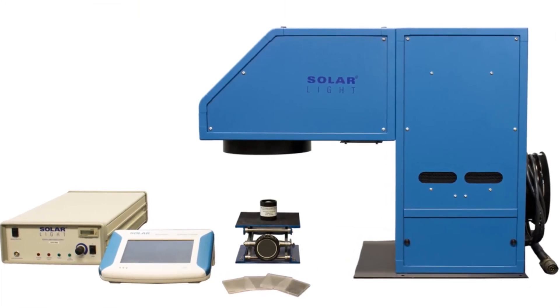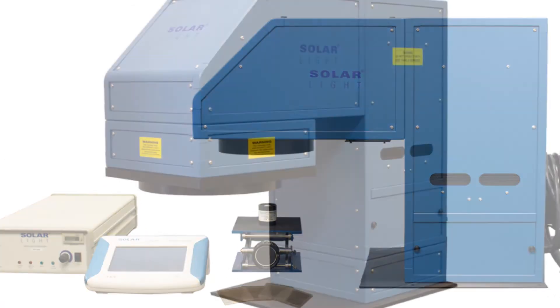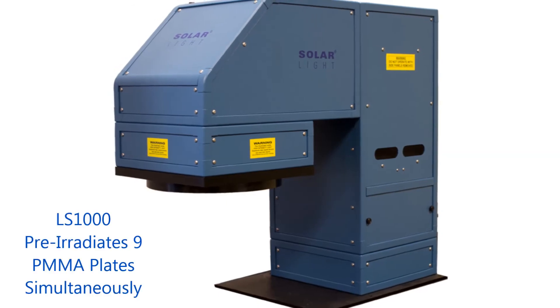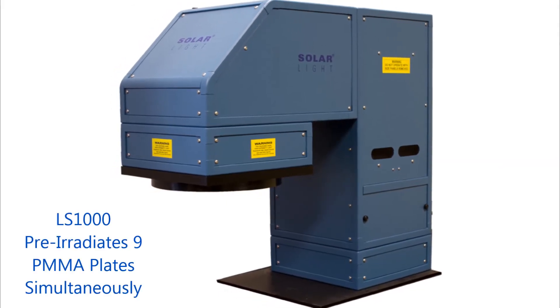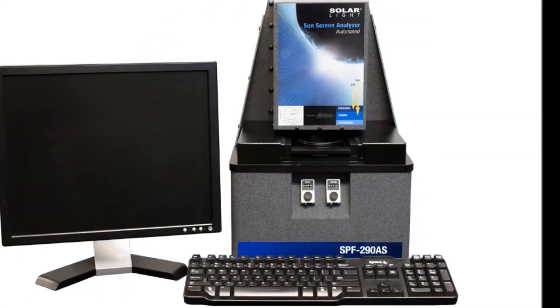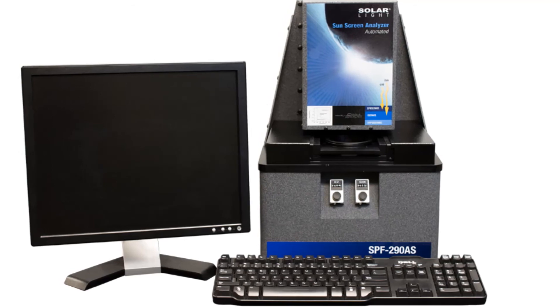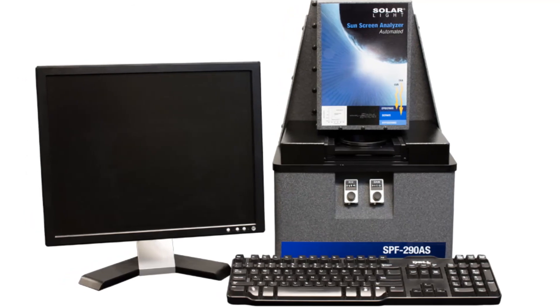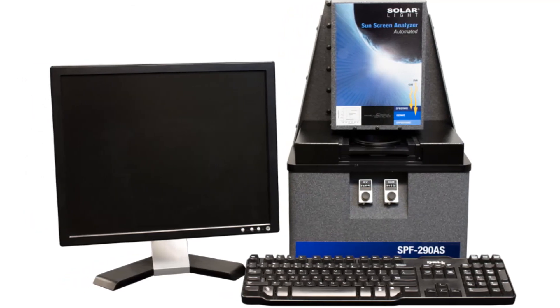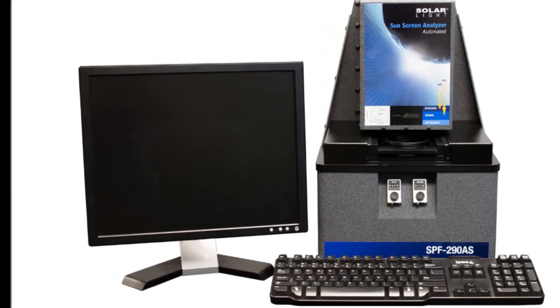Please note that the 16S-300-009 simulator is designed with the individual lab user in mind. If your lab application involves high throughput, please ask us about the LS-1000 series simulator, which can irradiate up to 9 PMMA plates simultaneously. We also offer our state-of-the-art SPF290AS Sunscreen Protection Factor Analyzer, complete with computer, monitor, software, and validation kit, which meets FDA and ISO 24443 requirements.